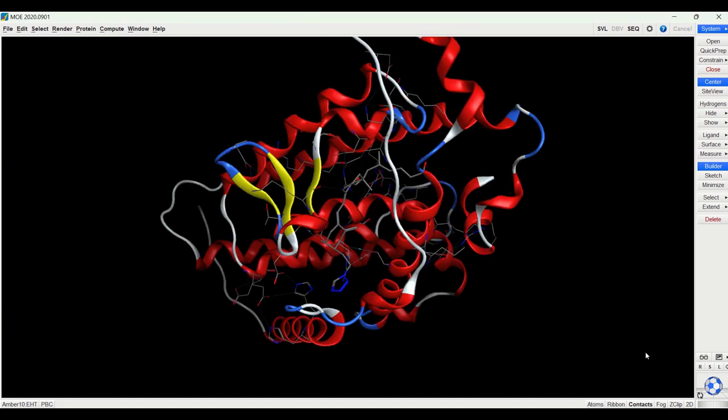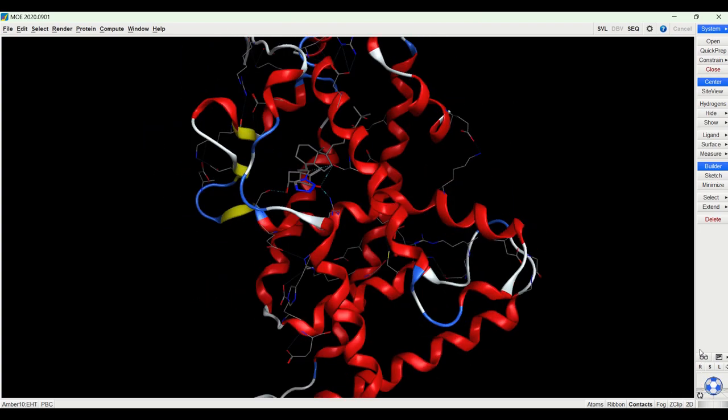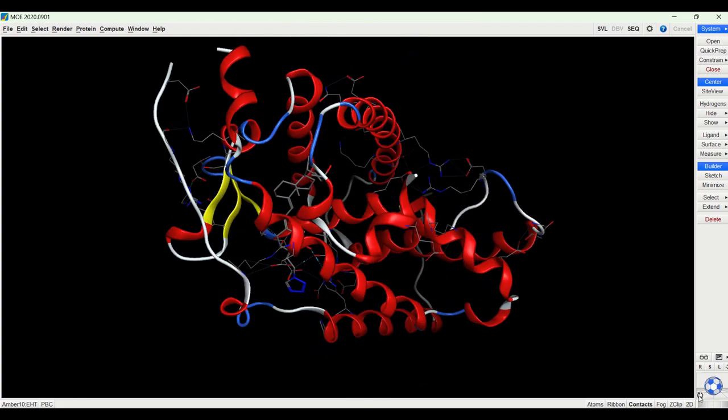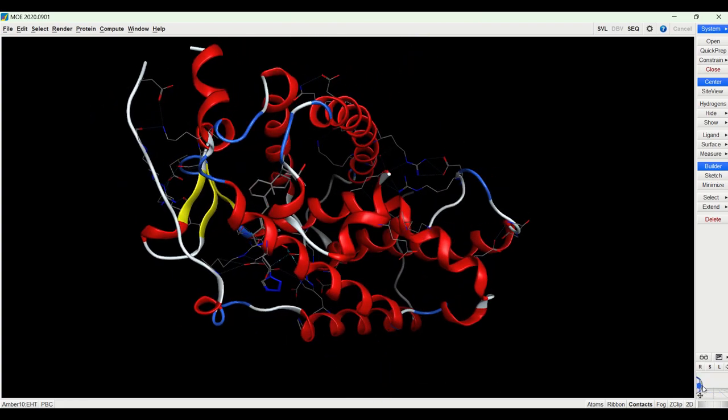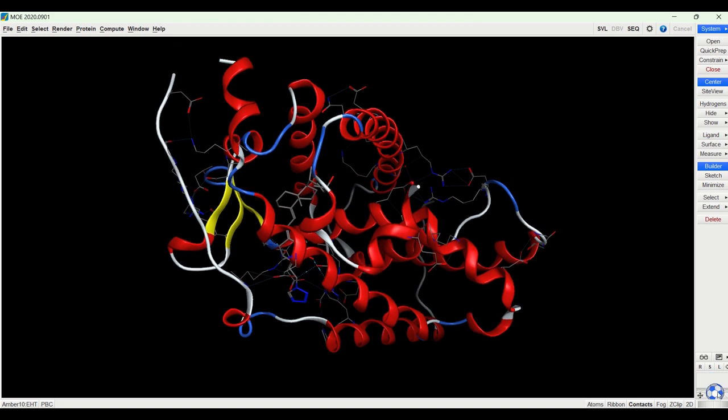So to move this around we would use these controls here. So right now it's set to spin the protein. So if you click and drag here, we'd be spinning it from side to side or up and down. And if we check here, then we can move the protein from side to side or up and down.